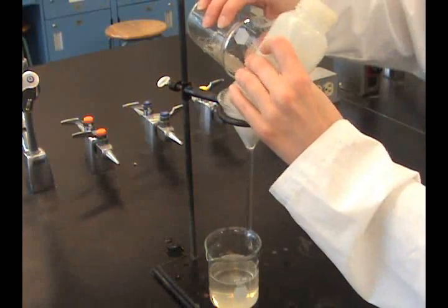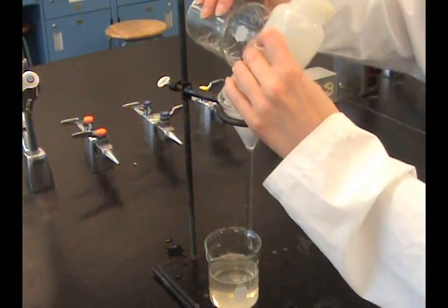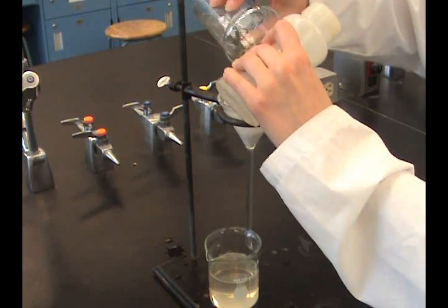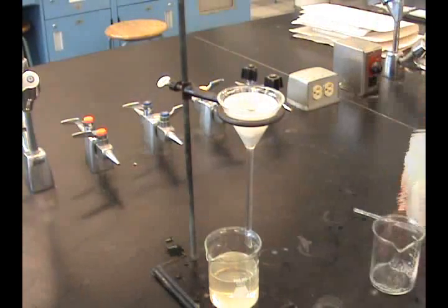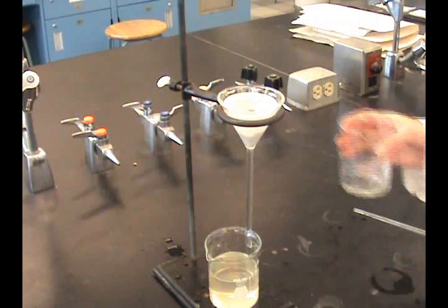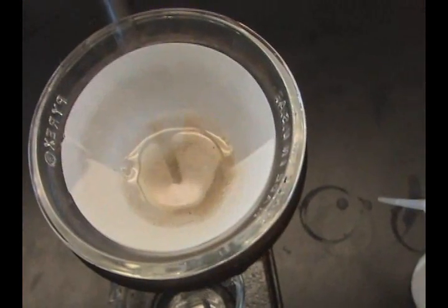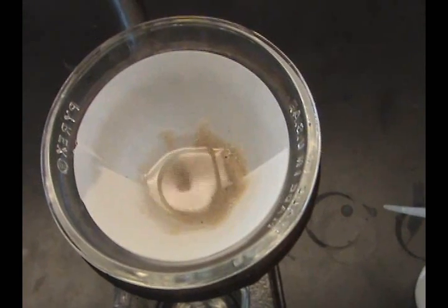Use a wash bottle to create a stream of liquid to transfer the solid left in the beaker. Wash the precipitate with several wash portions by adding water or solvent to the beaker, swirling and decanting into the funnel.